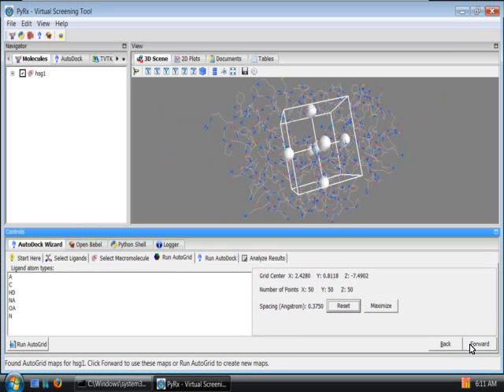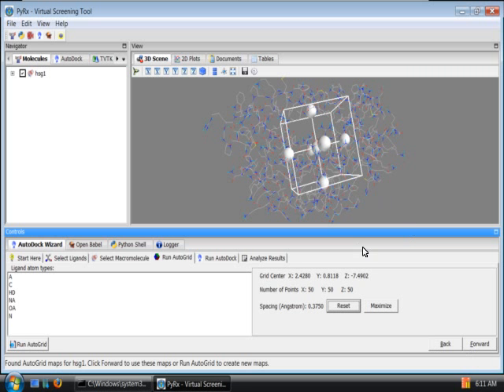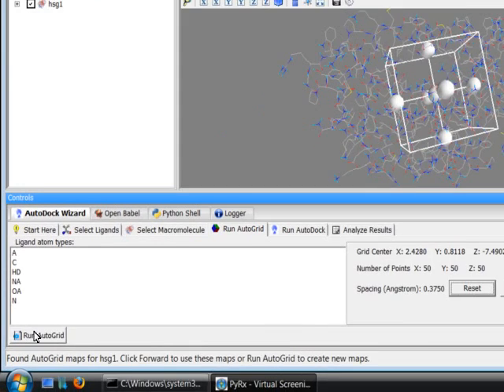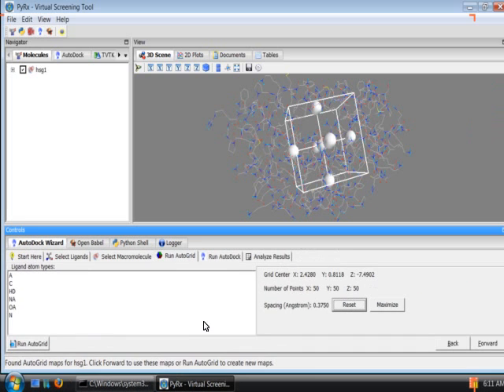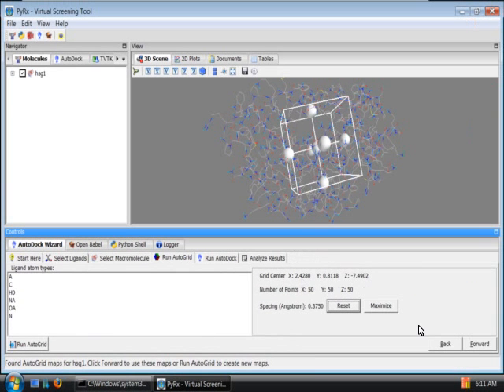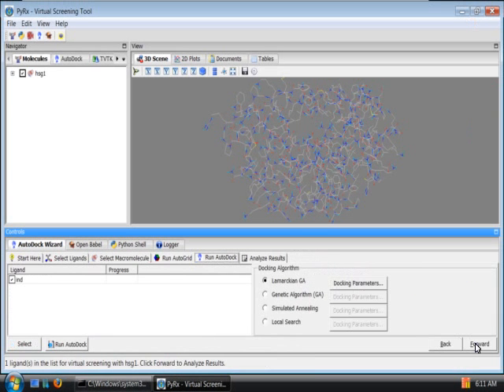When I click forward it can run autogrid if autogrid maps are not available. If they are available they will be used for the next step. If you'd like to rerun the autogrid you can click on this Run AutoGrid button here. So I'll click Forward to go to the next step.